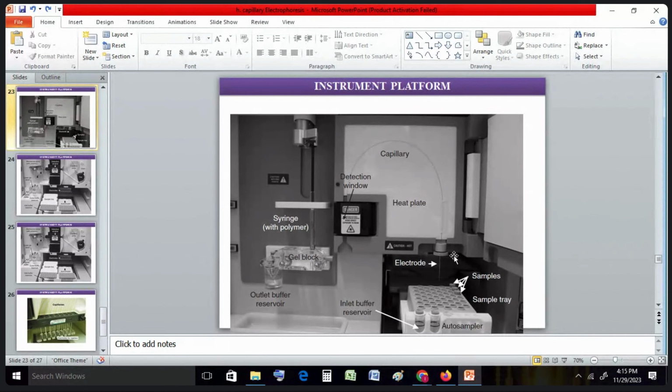What is the disadvantage of this machine is, for each and every sample, you have to wait for the first sample to run first, then the second sample, then the third sample. So you cannot simultaneously run multiple samples together. So now you have like 98 samples. You need at least 1 minute for each, at least 100 minutes to finish. So it was a problem, as you have many samples nowadays, you have to do quickly.